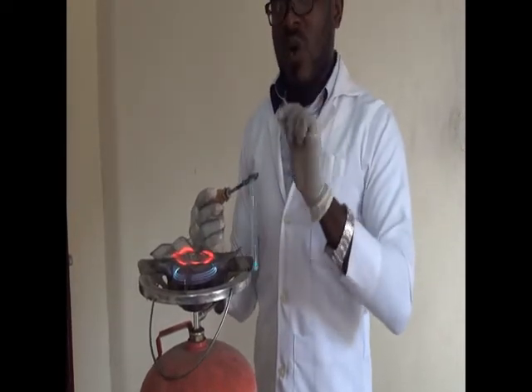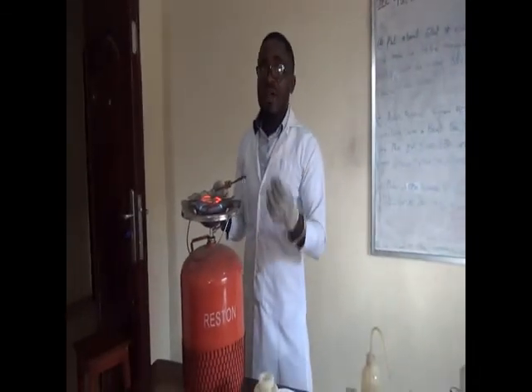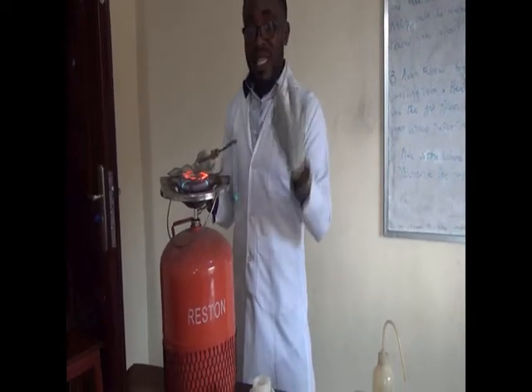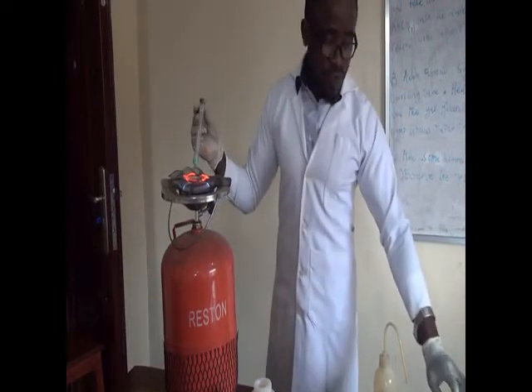If it was another acidic gas, because chlorine is an acidic gas, it will always have a choking smell. Ammonia and the rest of them will have one too. Ammonia is basic to litmus, but it will always have a choking or irritating smell. Now, here we still continue to heat. Remember, it was to be heated for 20 minutes.